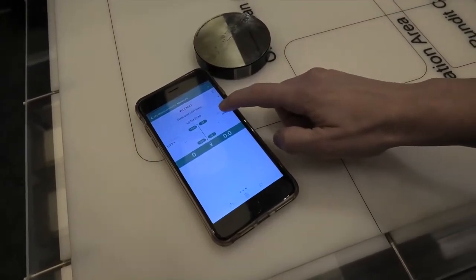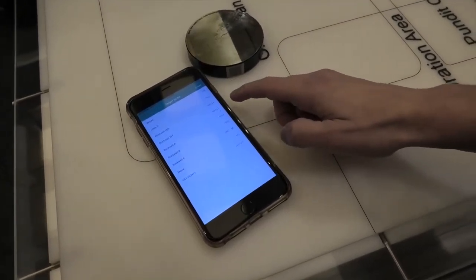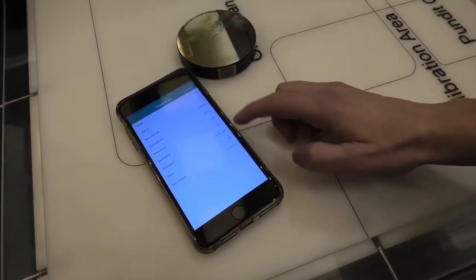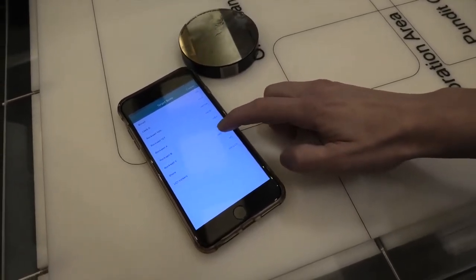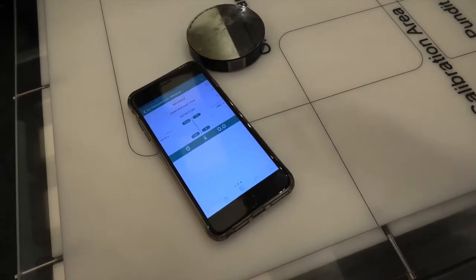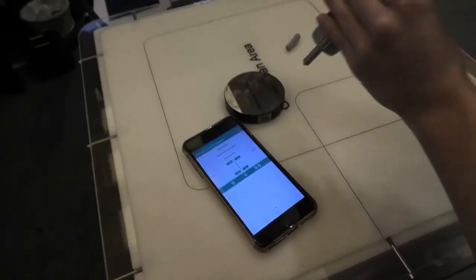And finally, here we choose which scale we want to convert the readings to. And here I've chosen Rockwell C. And now I can proceed with the test.